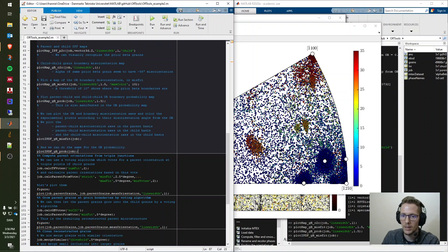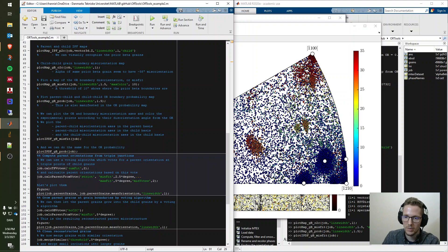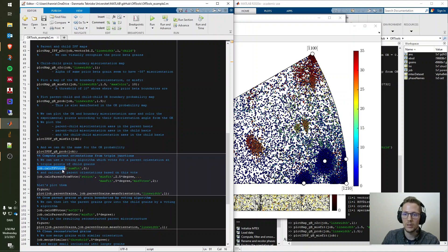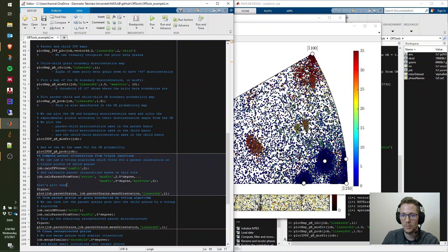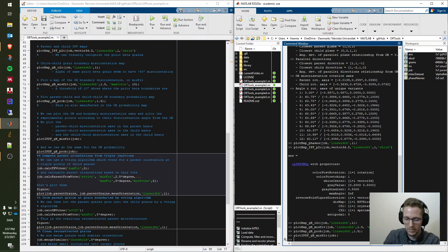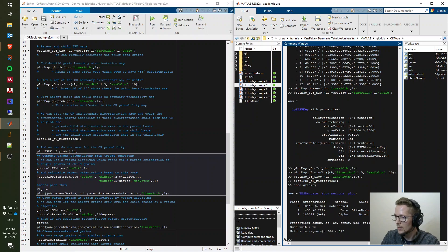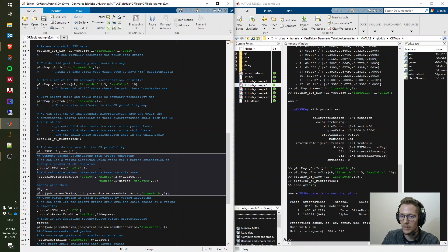Now we get to the actual reconstruction. The code is borrowed from the MTEX homepage. We calculate triple point votes by looking at triple points between child grains and returning the two best parent orientation fits. From those fits we decide the best parent orientation for each combination of grains, allowing us to reconstruct the microstructure quite quickly. The microstructure is about 380 by 500 points for reference.